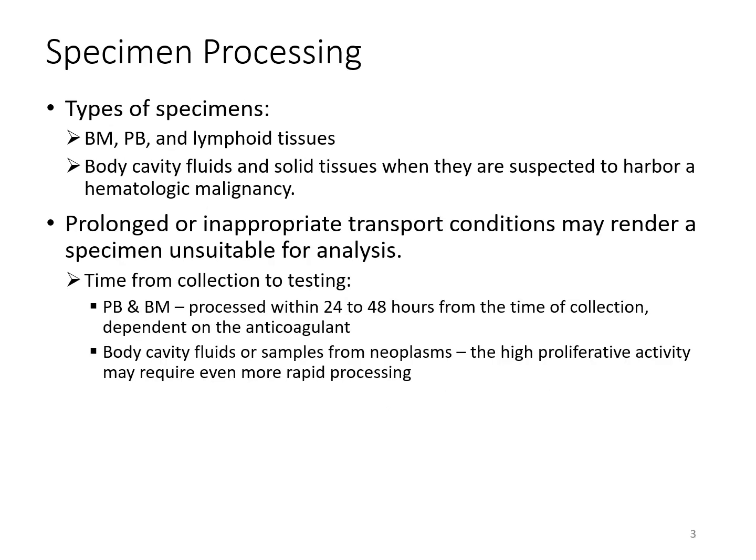Now, some of the samples that can be used for testing within flow cytometry include things like bone marrow, the bone marrow core, peripheral blood, spinal fluid, pleural fluid, fine needle aspirates, lymph nodes, and solid tumors. And what we do with all of these is measure the various cellular characteristics to include things like the granular makeup of the cell, the surface area of the cell, and anything that's internal to the cell.